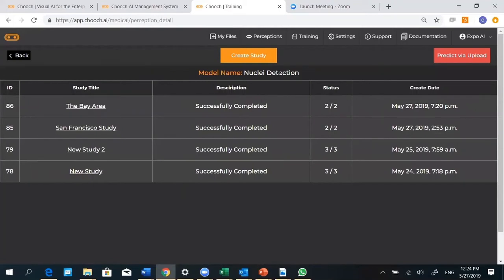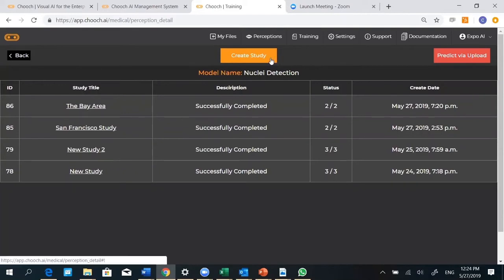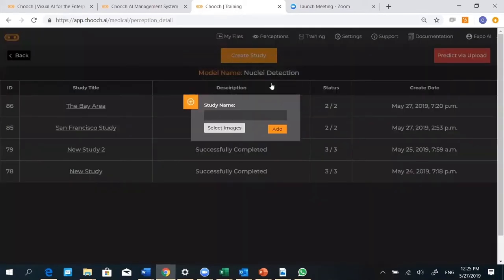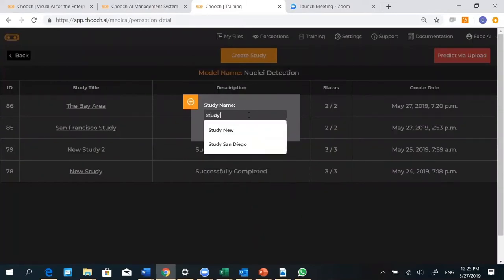Here you have the Nuclei Detection perception and all the details underneath it. Let's create a new study. This is based on images that you'll import into here, and Chooch will do the cell counting and cell detection for you. Let's create a new study. Let's call it Study 10.